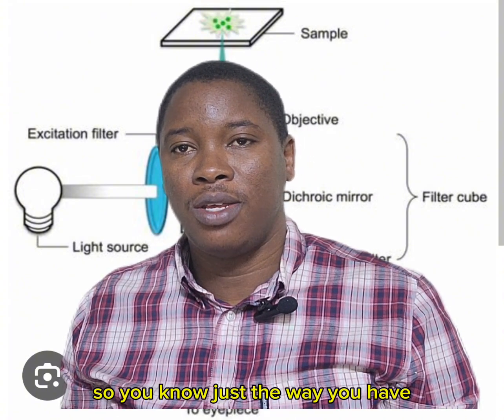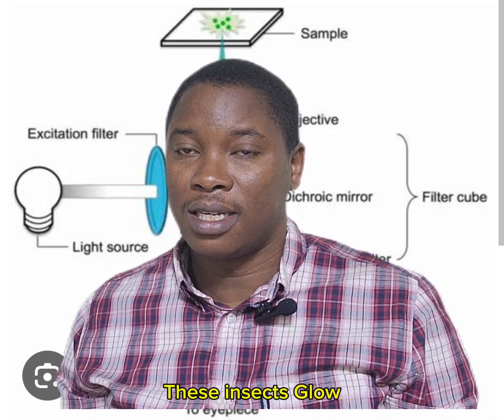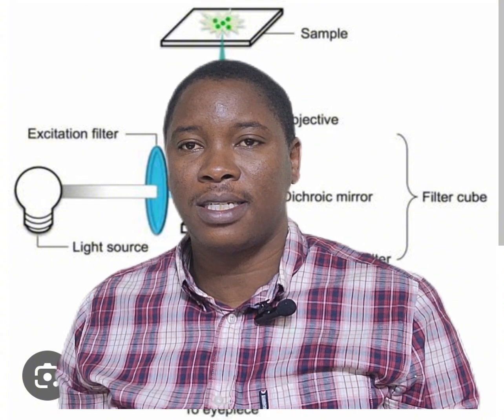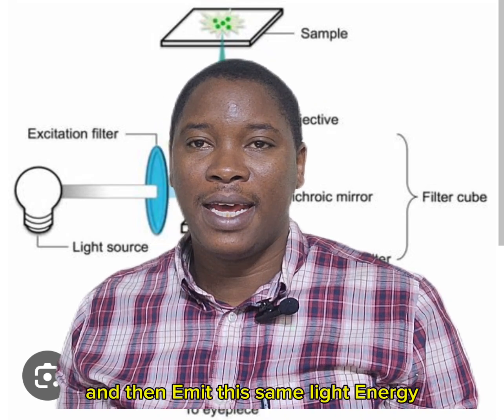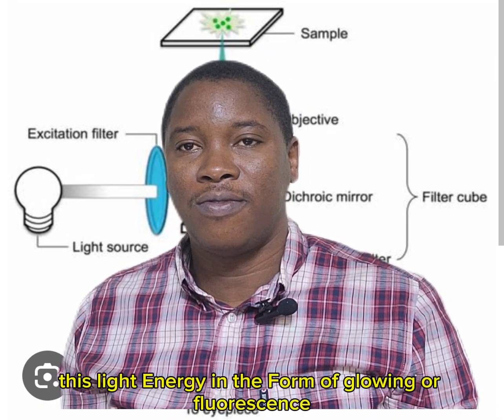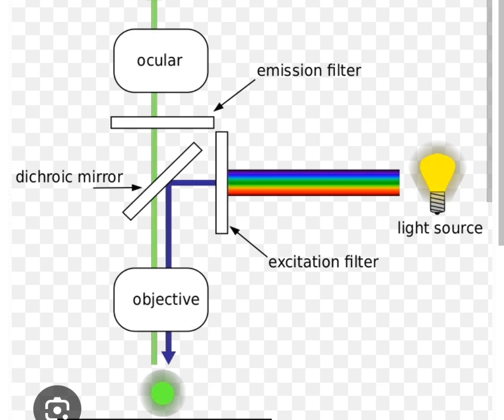Just the way you have bioluminescence in some insects, where at night these insects glow because they've absorbed energy and they're giving out that energy, that's the same way different components of cells are able to absorb light energy and then emit it. We see this light energy in the form of glowing, or fluorescence, and we're able to view that on the microscope. And this is really important for us to know.